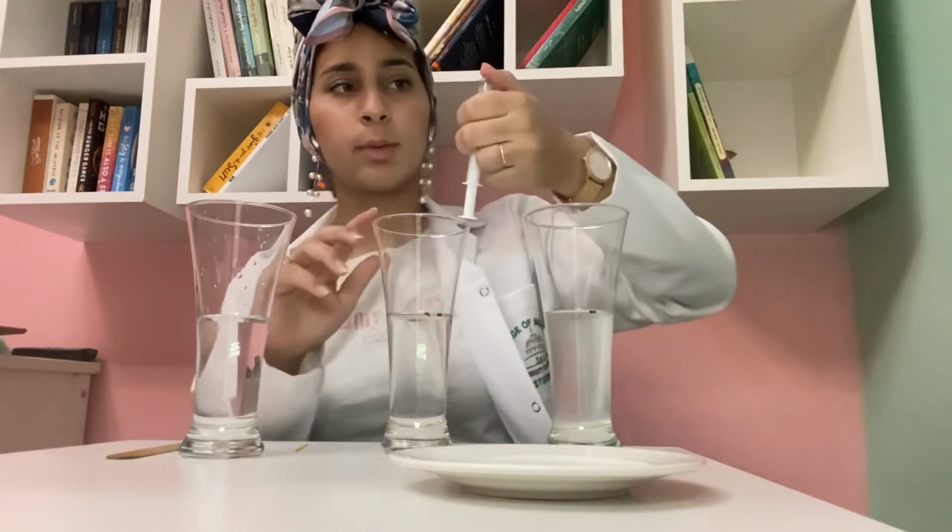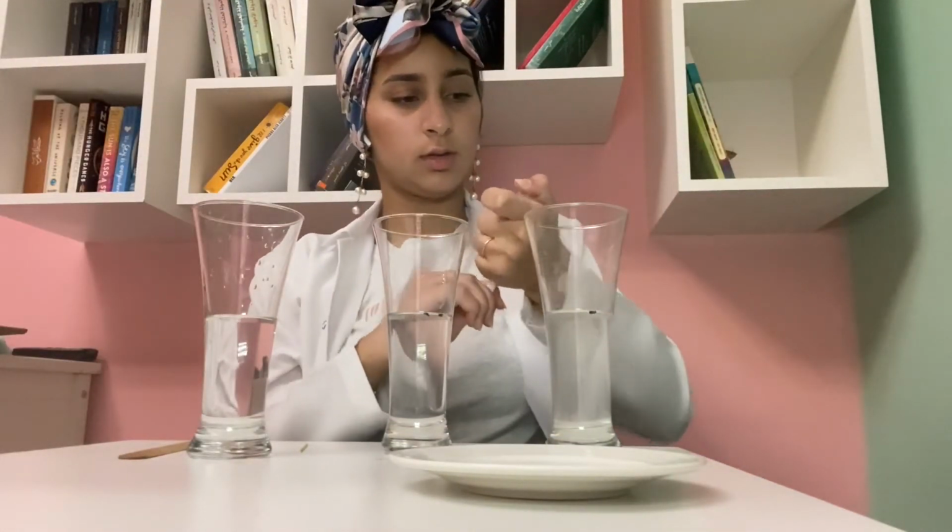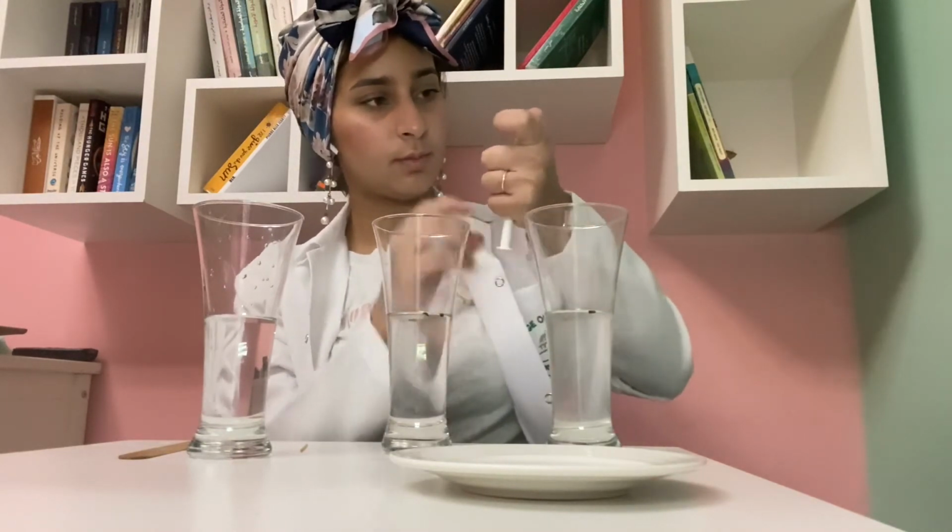We're going to close it from the top, and sometimes some syringes have a small hole. We can also close it. And we're going to press in and up, down and up, as much as we can, in this way, in order to try to remove all of the gases inside the sacs. So let's do it. We'll keep on doing this process until we see the discs coming down or sinking down. We can do this.